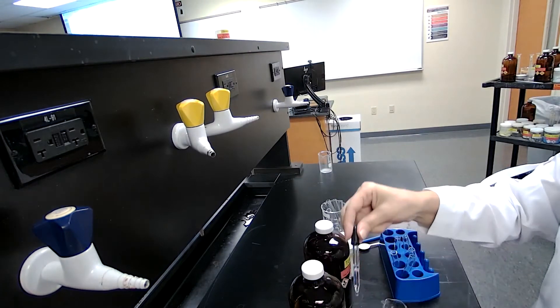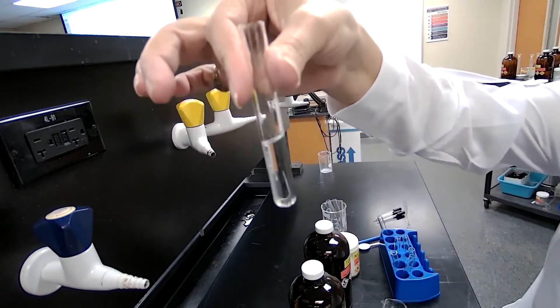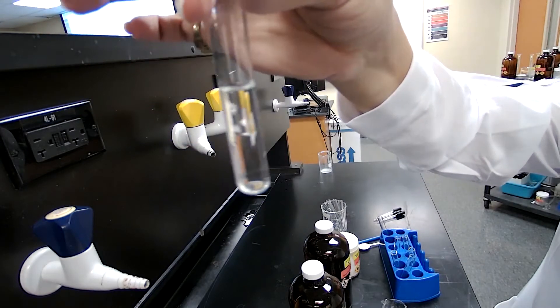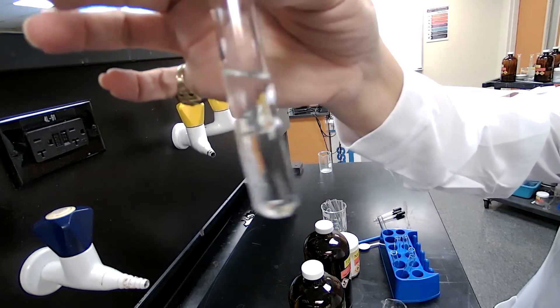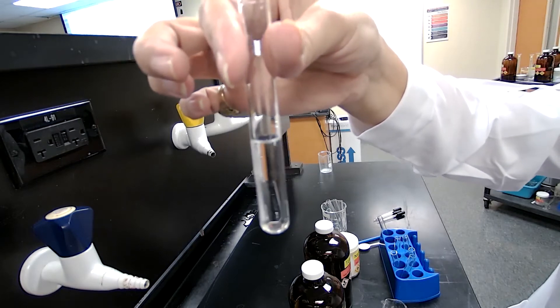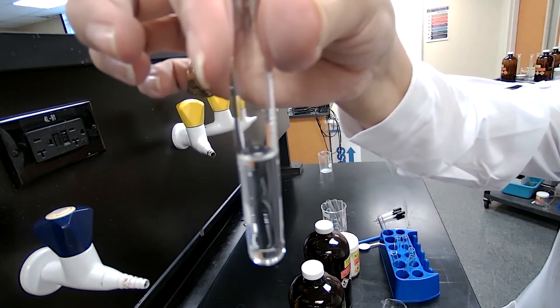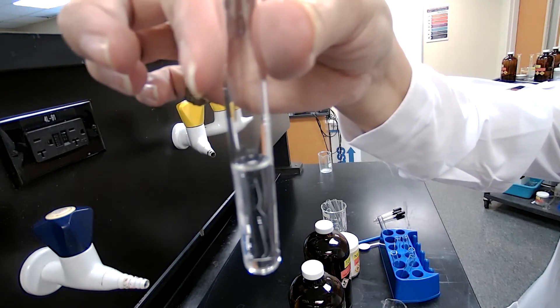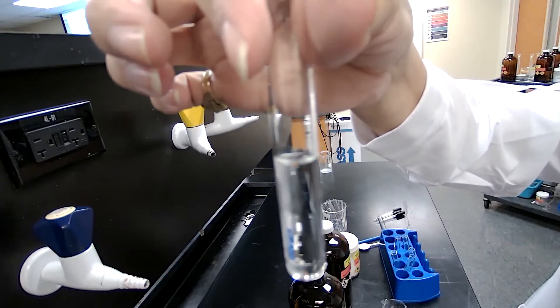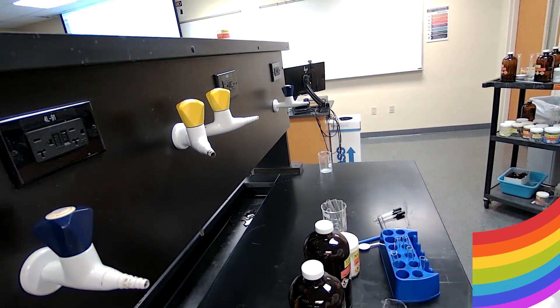Observe and record your observation. What you're trying to see here is if there are one layer or two layers formed. If the two compounds I mix — water and acetone — are miscible and dissolve, it's going to form one layer. If they are not miscible, it would form two layers.